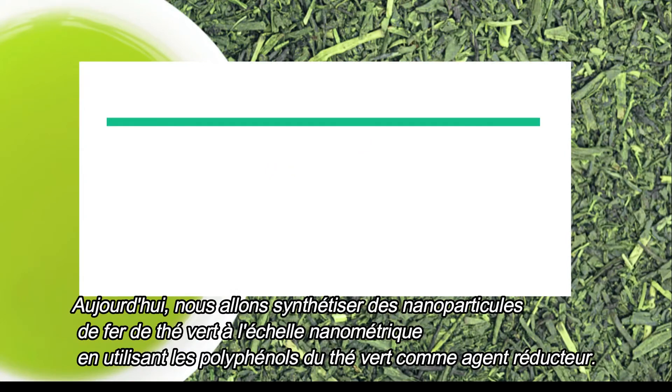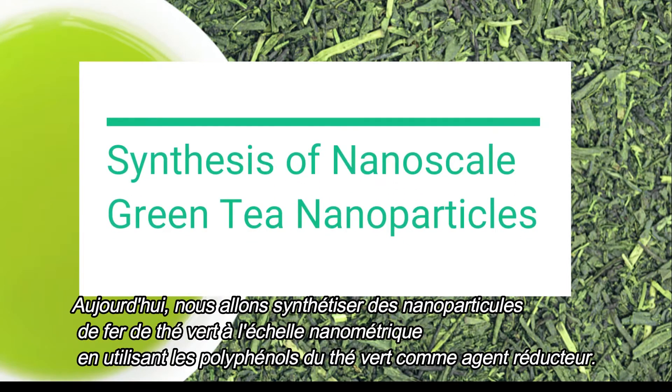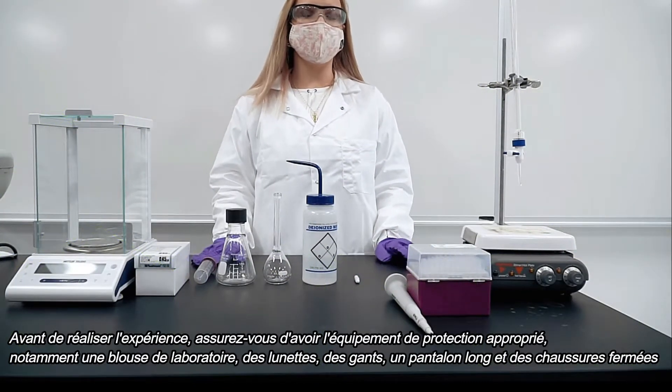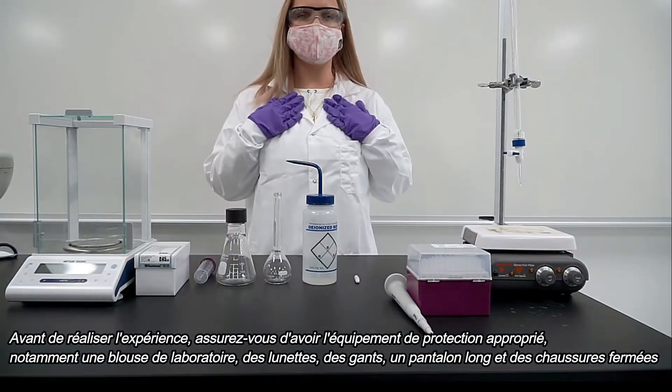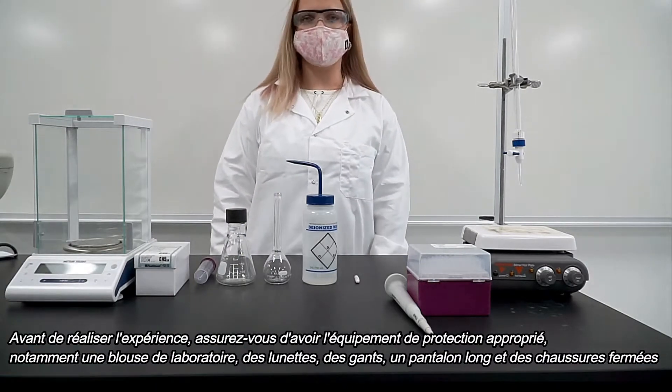Today we will synthesize nanoscale green tea iron nanoparticles using green tea polyphenols as the reducing agents. Before you conduct your experiment, make sure you have your proper protective equipment including a lab coat, goggles, gloves, long pants, and closed-toed shoes.